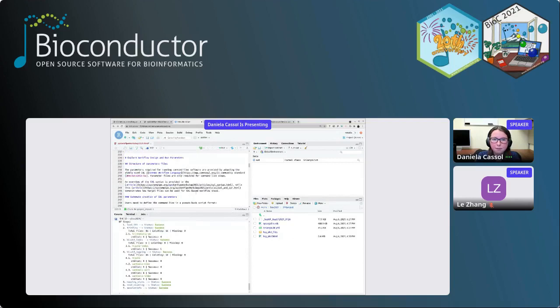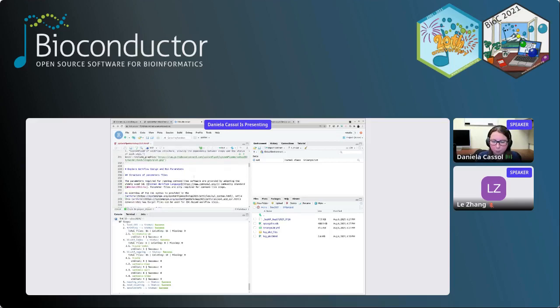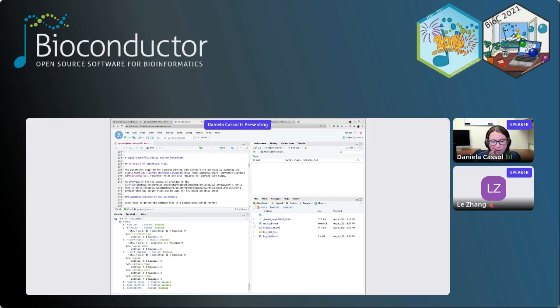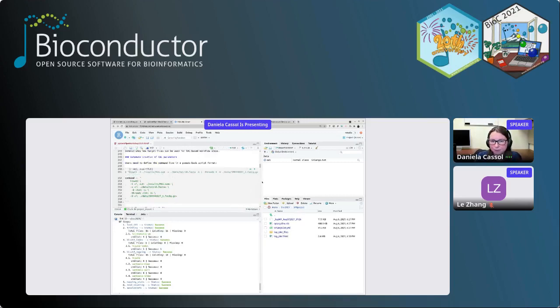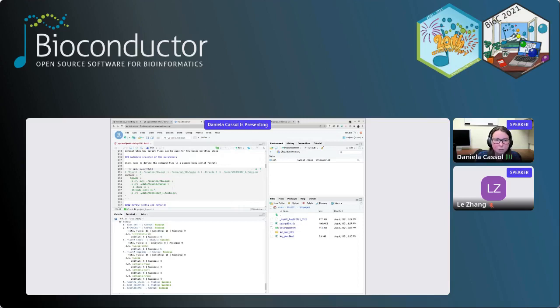Okay. To explore more about the design of this workflow, because here we just imported it from our R Markdown, so everything was defined there, let's dive into how to design that. Here we are doing this in interactive mode. But first, you can tell me: okay, I know you are using CWL for the description of the command lines, but I don't have time, or I don't want to learn all the details of CWL. If you say that, I would say, don't worry, because we do have functions, and we're trying to do this in a simple way, to create those parameter files for you, that description of the command line.